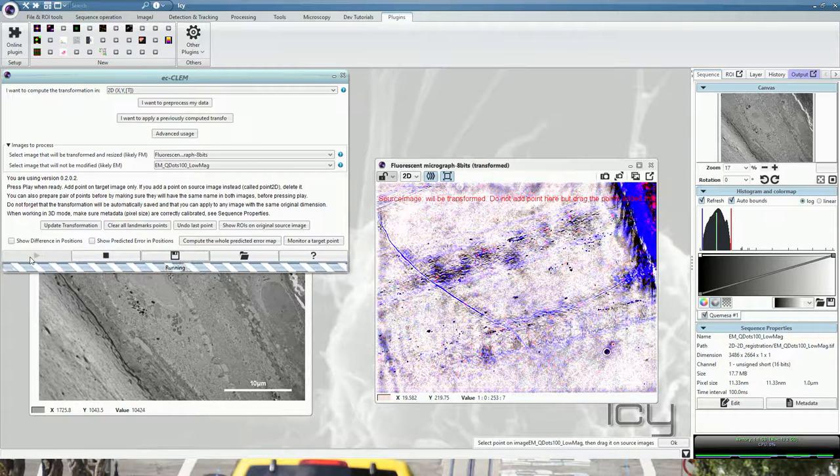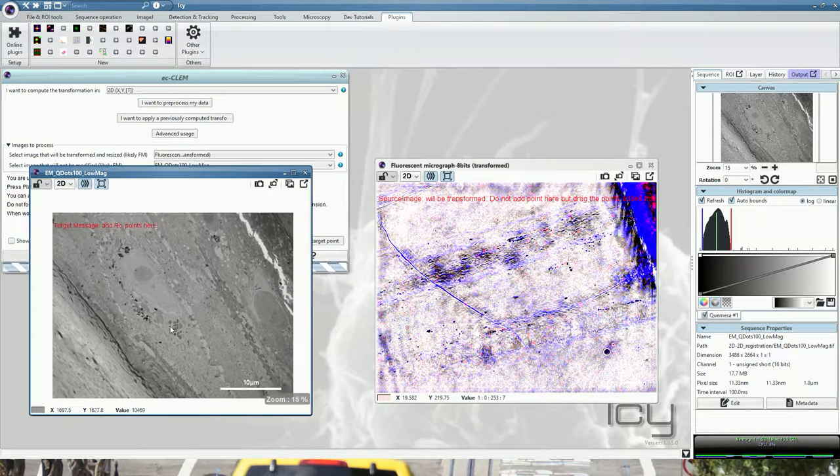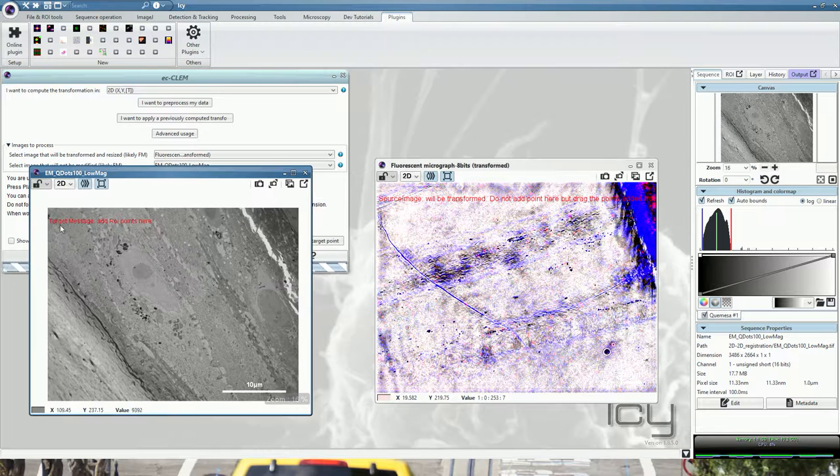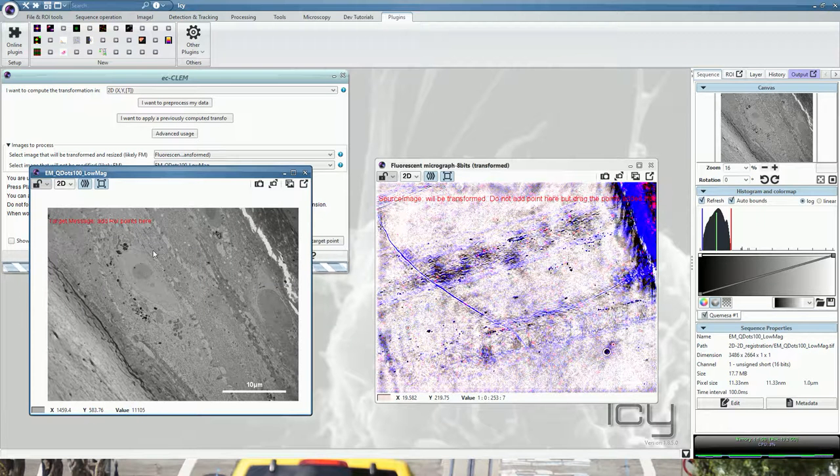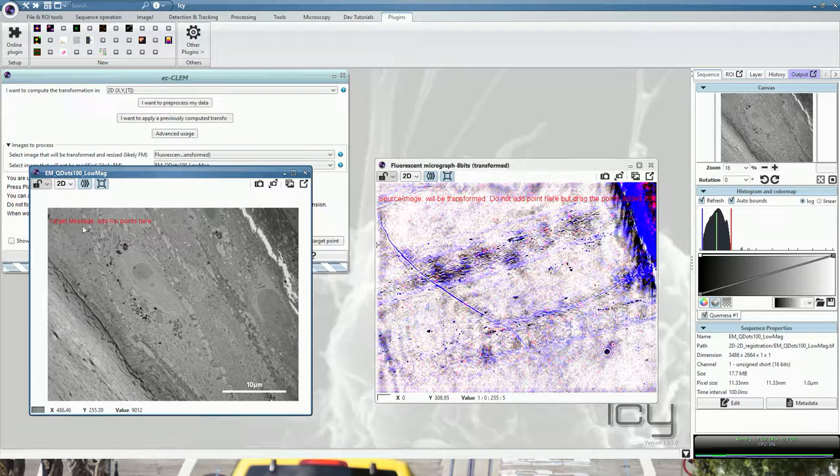Now that it has started, you can start by adding the point into the target image. Always go to the target and adjust on the source. It's written here and here.